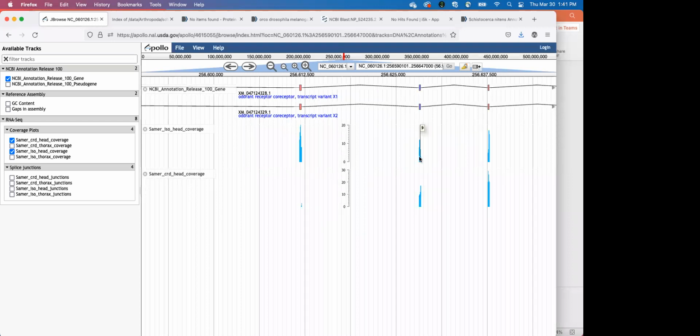What I look for there, and that's why I zoomed out while you were saying that, Anna, is to compare the coverage of the other exons, because if there's universally low coverage across the gene model, then I might be wary of coming to that conclusion.